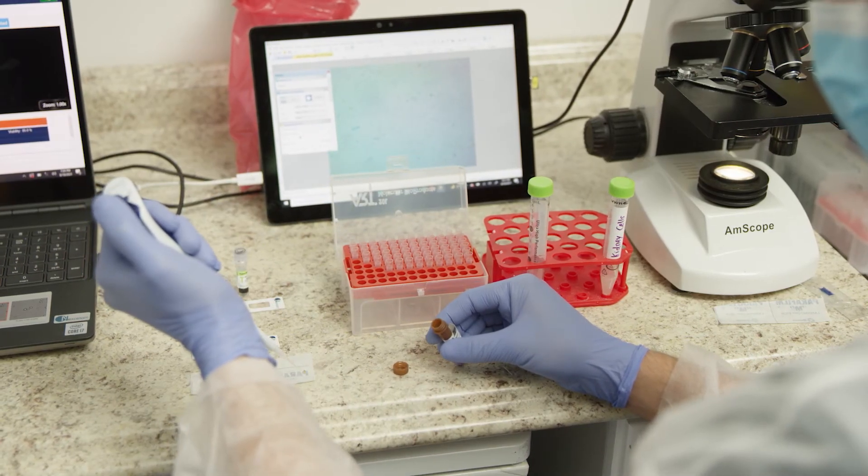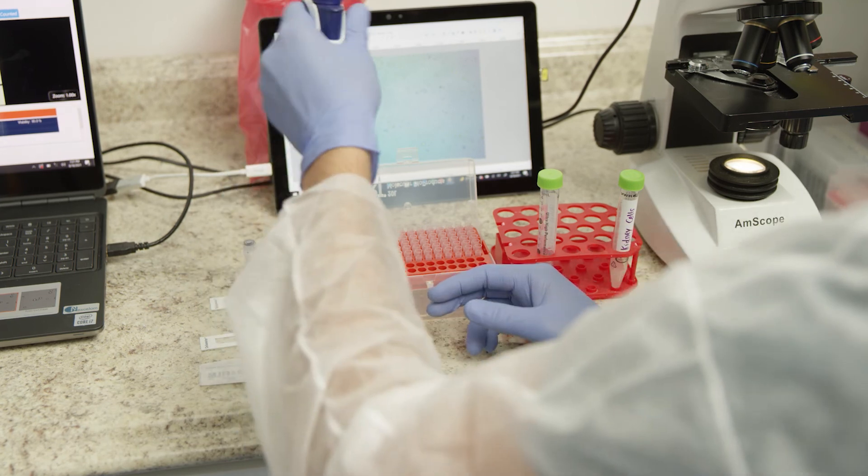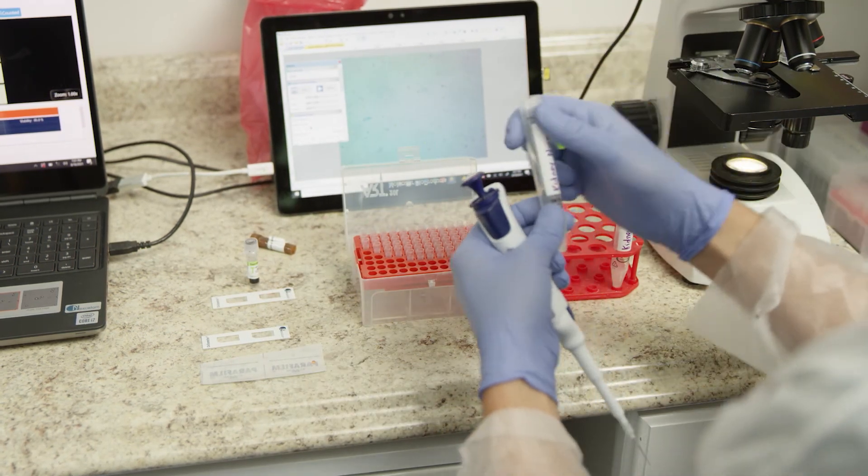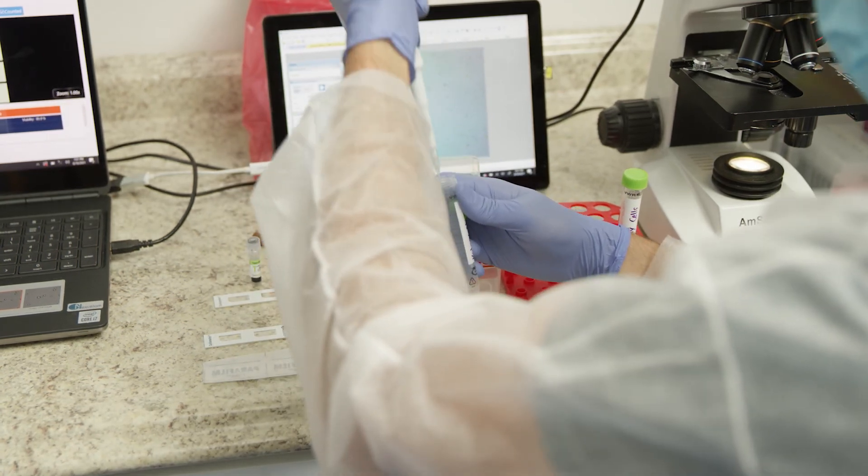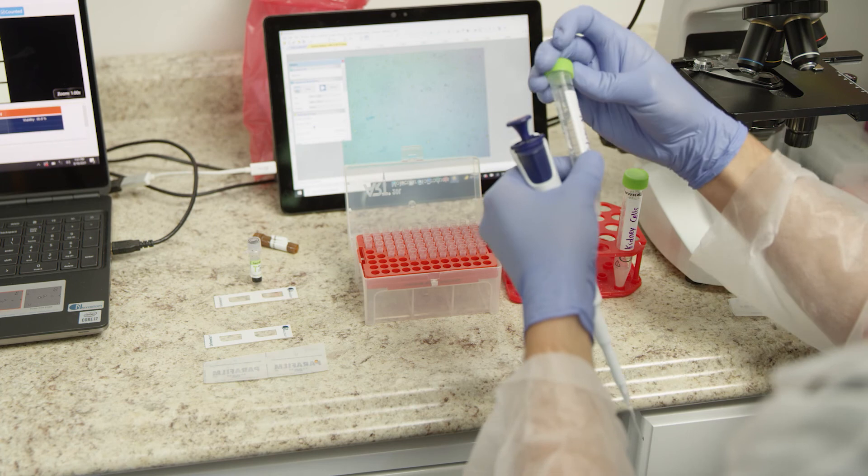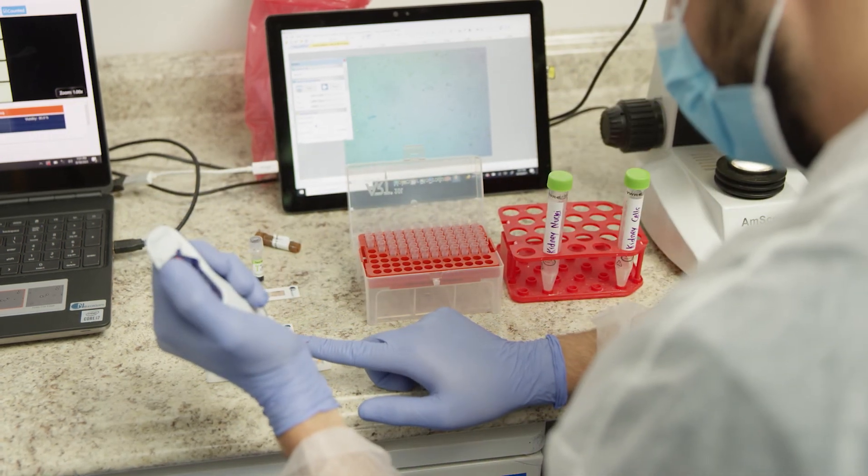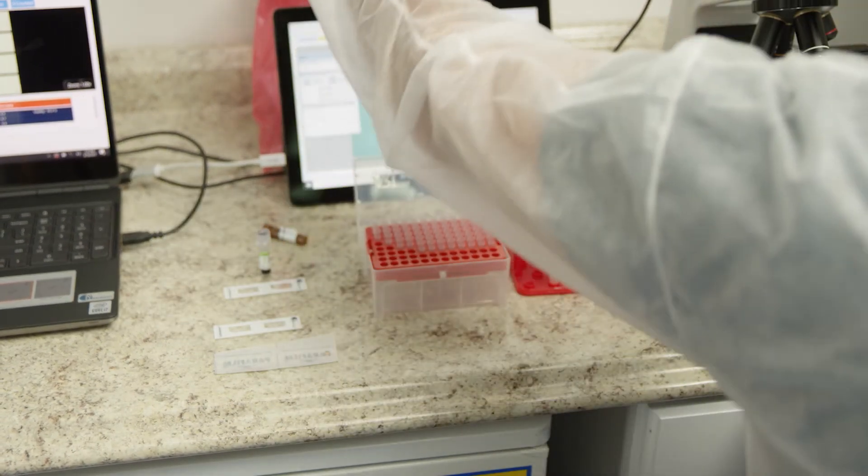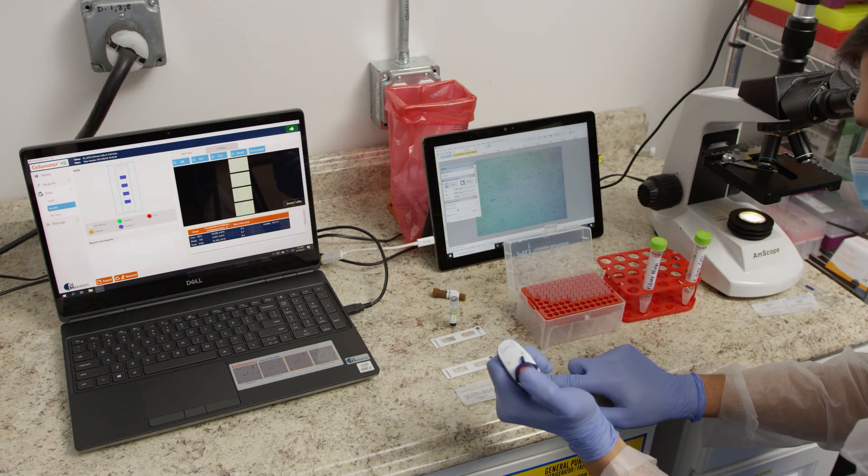For use of Trypan Blue, mix 20 microliters of Trypan Blue and 20 microliters of sample. Then add 10 microliters to each side of an analysis slide for counting.